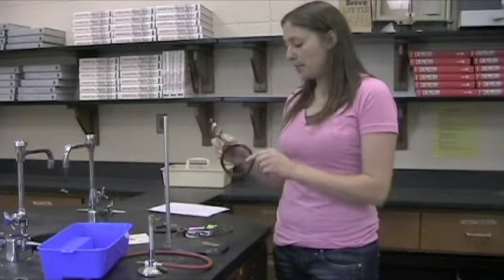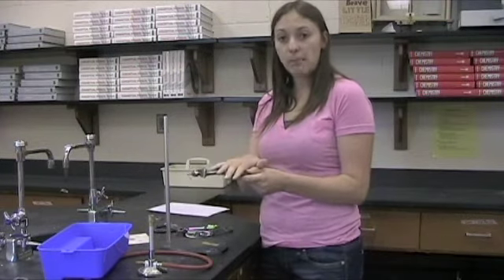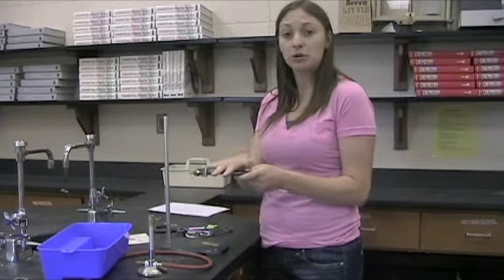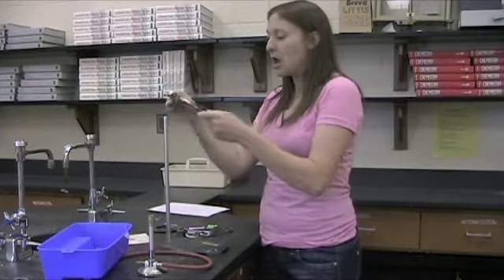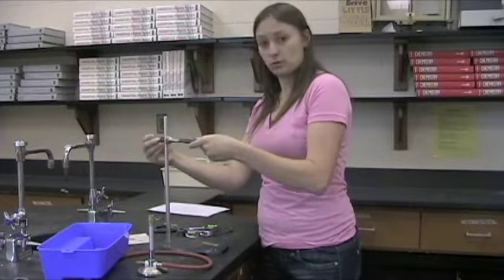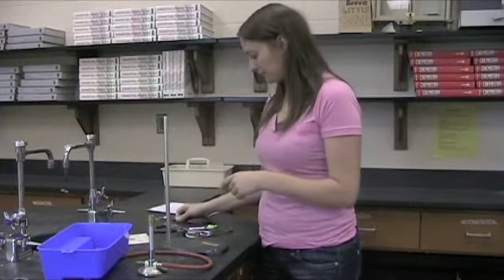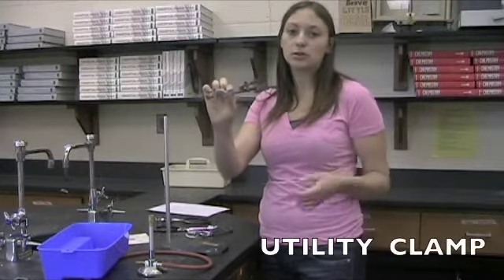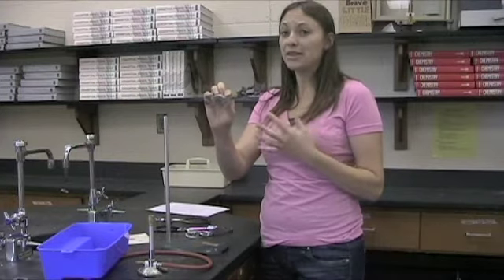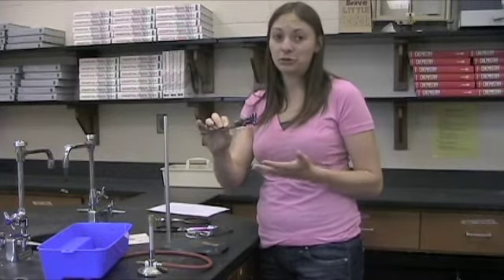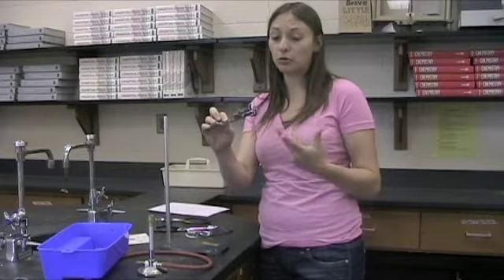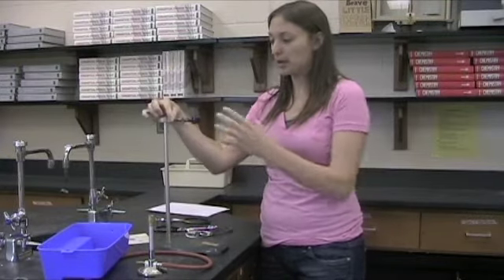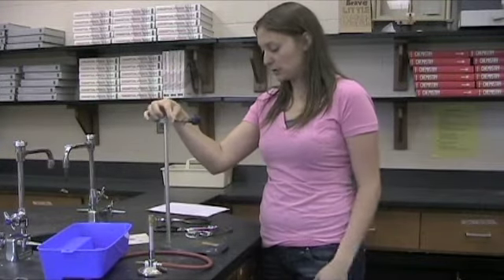You have a ring clamp, which is something you'll use all the time. You'll often put a wire gauze on top of it. Sometimes you'll put the pipe stem triangles or the clay triangles on top of it. And then they clamp right onto the ring stand. You'll also have what's called a utility clamp, which can hold test tubes, thermometers, anything else that you want to put over a flame usually. Or if you want to put something in a water bath, you can use a clamp and then it clamps as well right on to the ring stand.